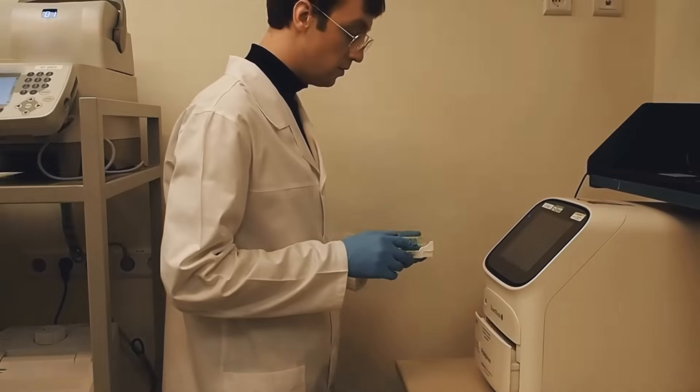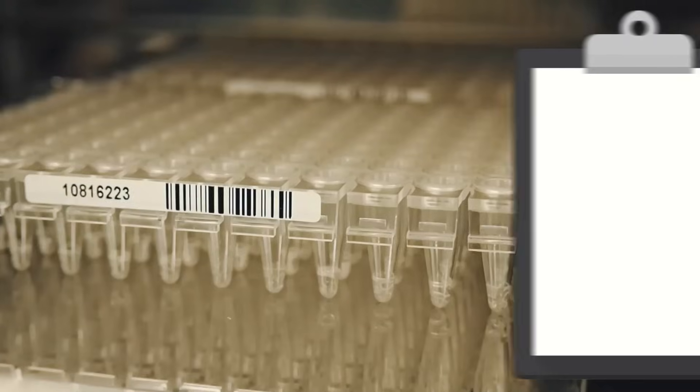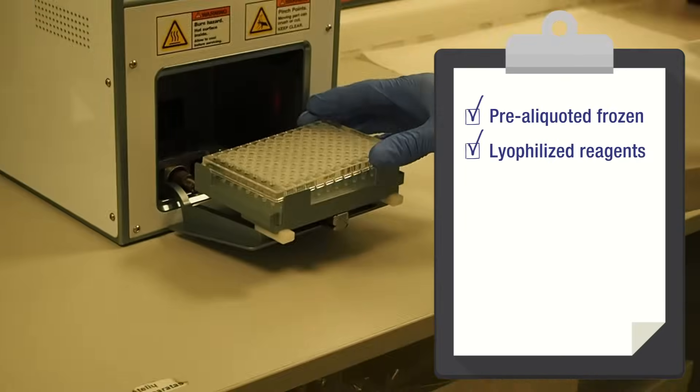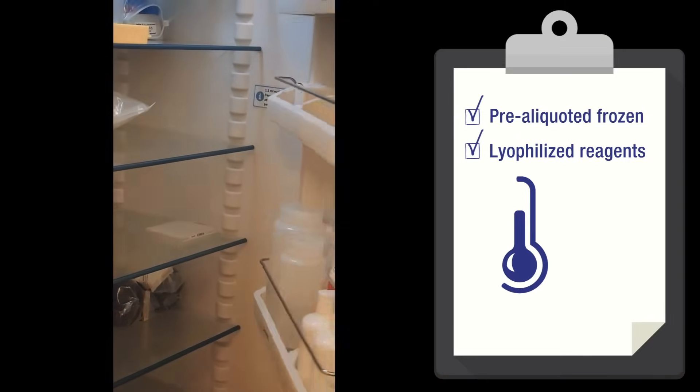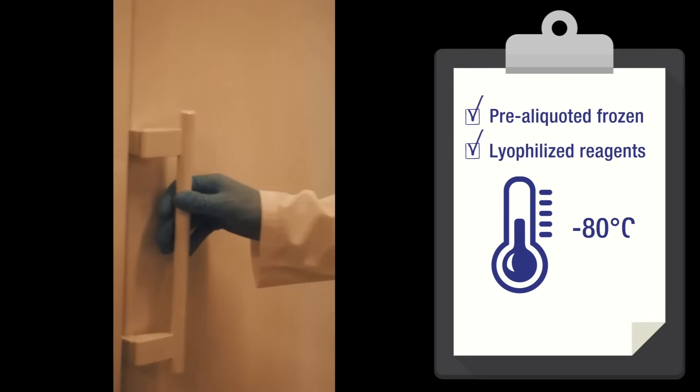They work well with common PCR and qPCR instruments for pre-aliquoted frozen and lyophilized reagents. Additionally, these plates remain stable after storage at minus 80 degrees Celsius.